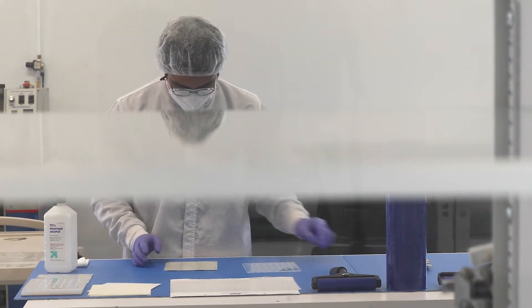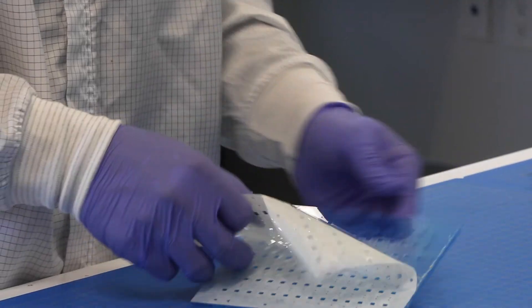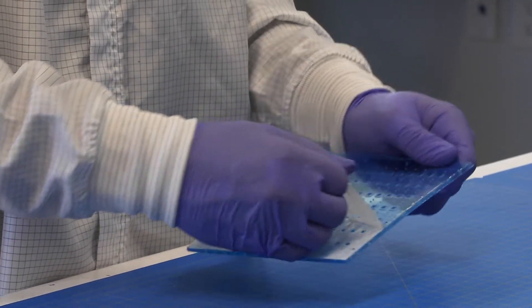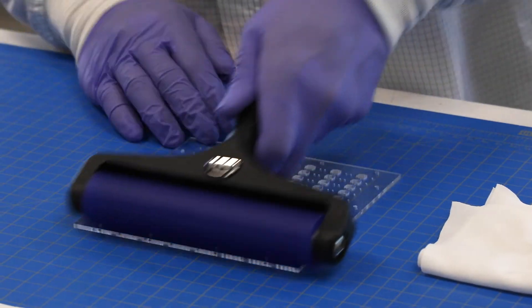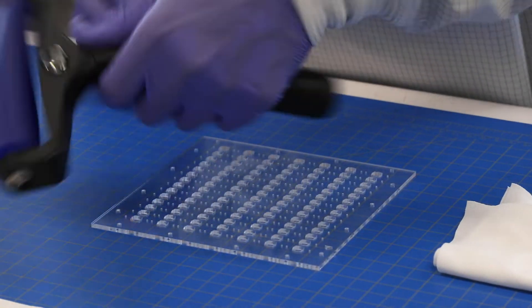One thing to keep note is that thicker materials tend to be a bit more difficult to bond well with each other, but A-Line does have different process for dealing with different kinds of and thicknesses of materials to ensure proper bonding.